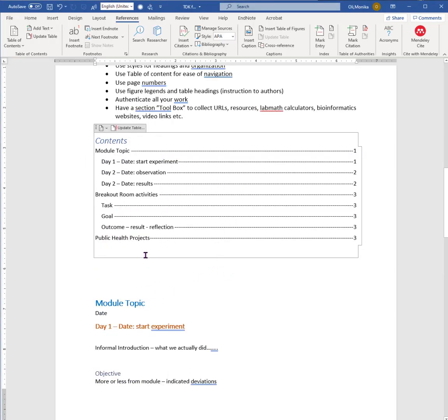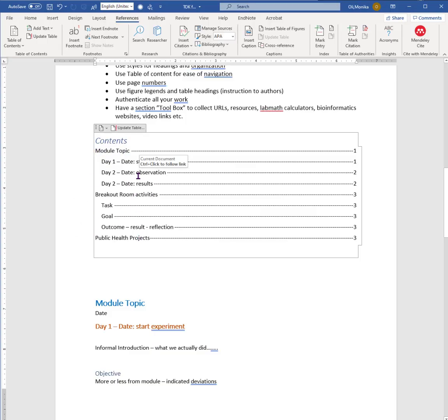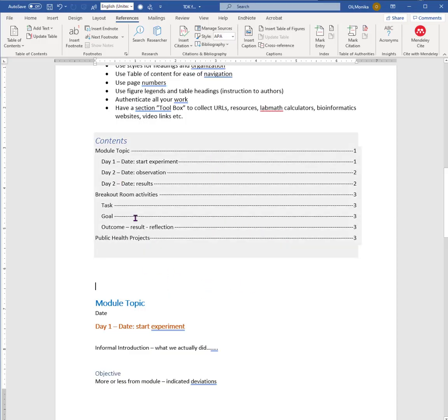But you can see that your title one, your topic, is always on the first without the indent, and then breakout room, public health projects and so on. Again, exactly how you format is entirely up to you, but keep it organized, keep it nice and tidy, have a table of contents on there.